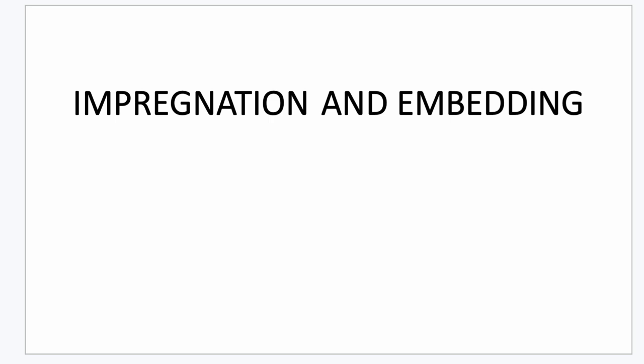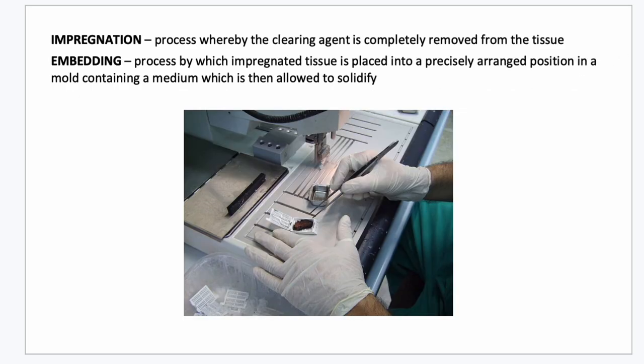So good day everyone. Today we are going to be discussing impregnation and embedding. Impregnation is also known as infiltration. So infiltration or impregnation is the same.